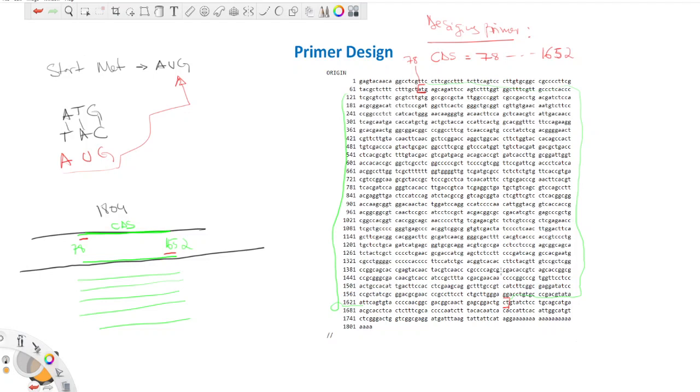But for this tutorial, just to make everything easier, I would like us to just select from this and going down as well, just for uniformity, so that we can all follow a single thing. But in real life, remember we spoke about the length of the primer, the GC content, annealing and melting temperature. You may want to go a little bit back before your actual start or after, so you can have the optimum condition.